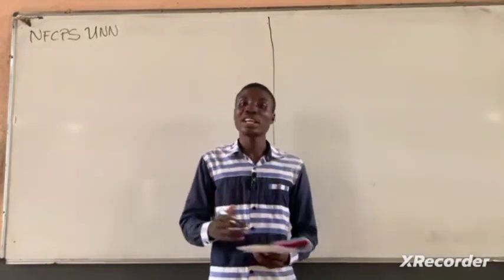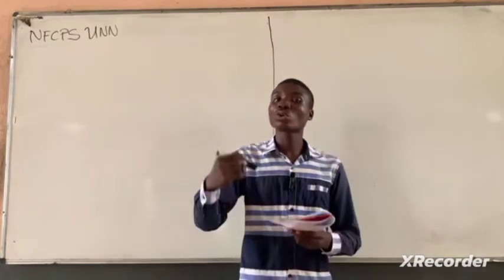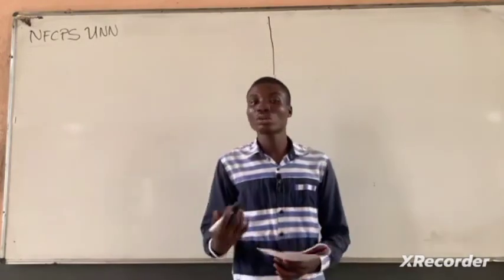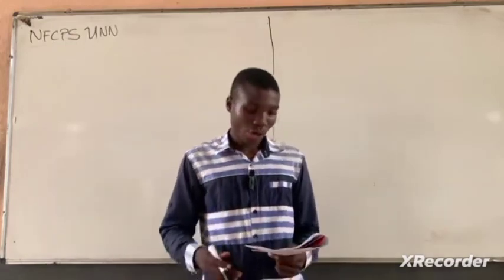So let us look at experiment 1 of this particular course: action of drugs on the isolated guinea pig ileum. Since we are working with the ileum of a guinea pig, the solution we are using, the physiological salt solution, that is PSS, is Tyrode's solution. You may want to look up the components of the Tyrode's solution and also memorize that, because you may be asked in your examination.